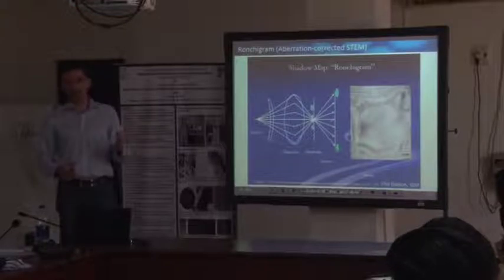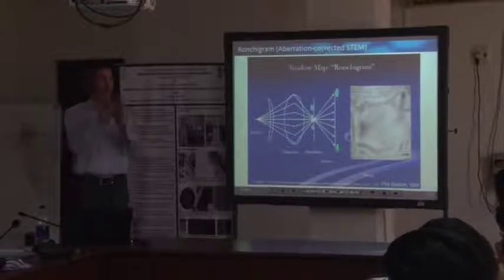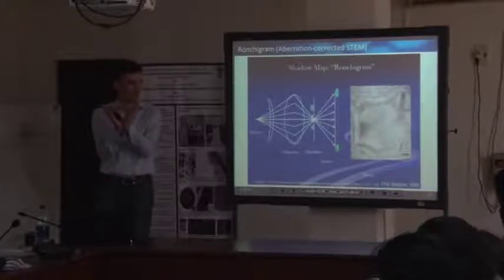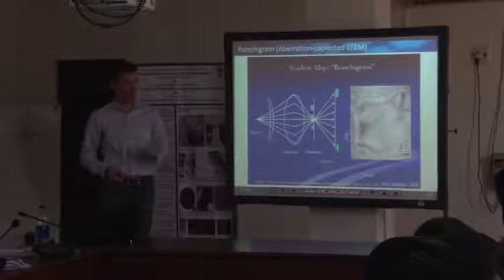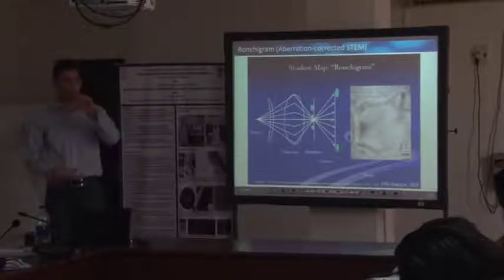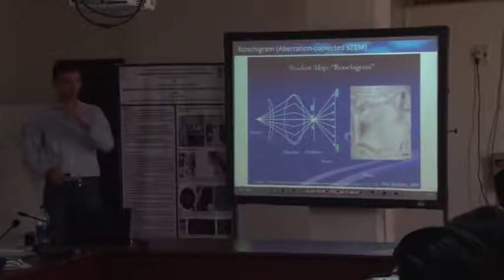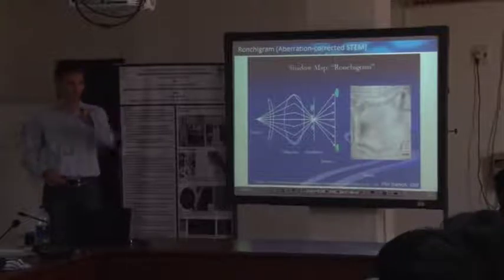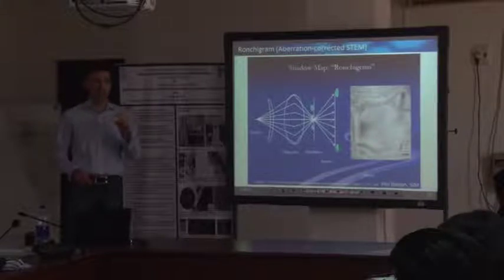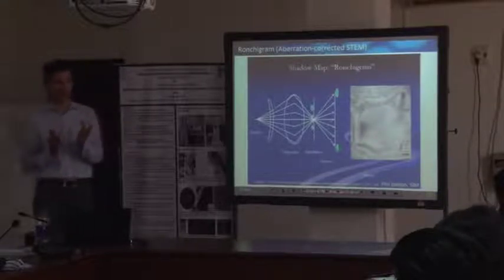We have to keep in mind, this is what you learned during the SEM session: the larger our convergence angle is, the smaller is our depth of field. So our depth of field for such a probe-corrected probe is so small that you can even section your sample every 2 or 3 nanometers. There are tomographic techniques where you focus on top of your sample, go 3 nanometers down, take another image, another 3 nanometers down. You go through your sample, and you will only see a very thin slice of your sample in focus.